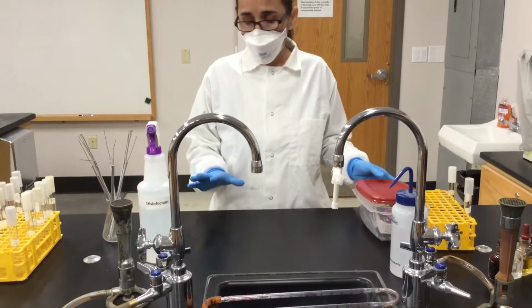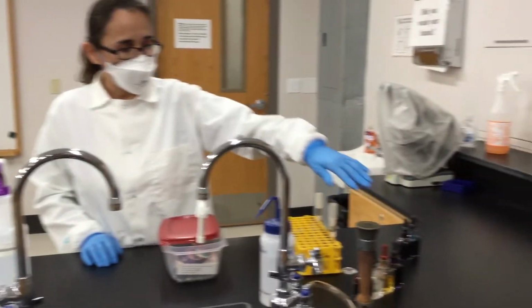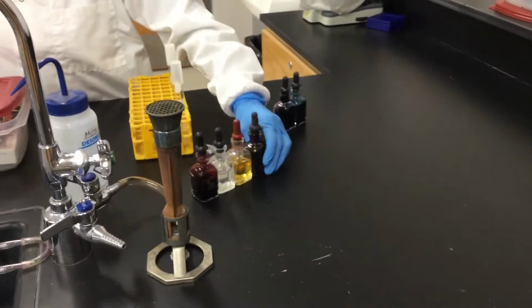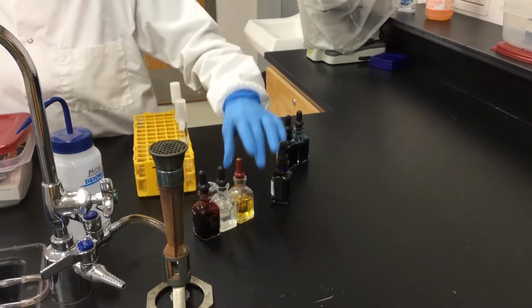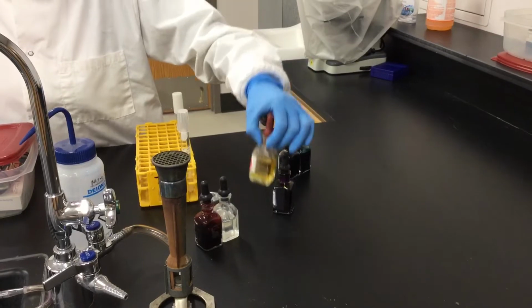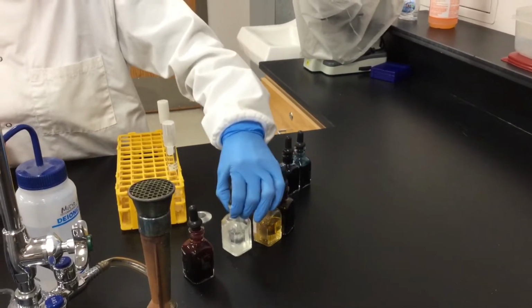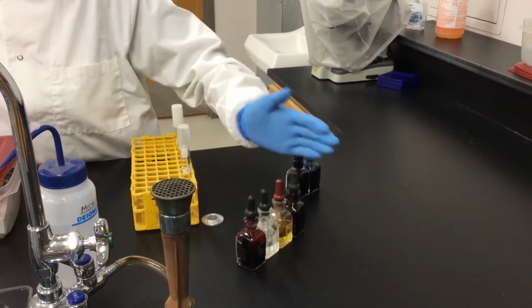You will also have in this area your stains, your dyes. In the case of one of the staining techniques that we will be doing, the Gram stain, it includes crystal violet. It's the first stain or dye that you add. This is iodine, which is a mordant or a fixative agent. This is 95% alcohol. And then the counterstain, which is safranin. So they are applied in that order.